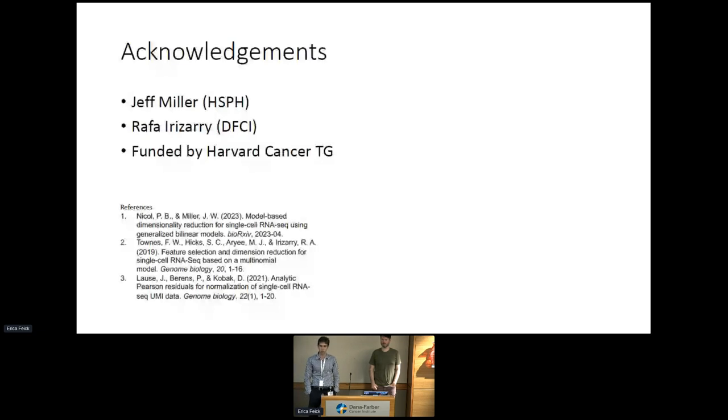When I've tried other count-based factorization approaches in the past, they seem to be more influenced by the highly expressed genes with many counts. They're trying really strongly to fit subtle variability up there, and they miss variability among the lower expressed genes. So I'm curious if you tried exploring your model, and can you still capture variability among genes that may have lower counts, or cell populations that are defined by those genes?